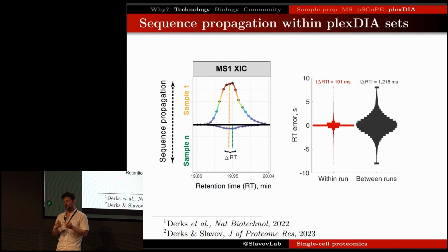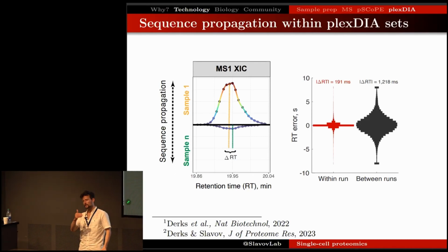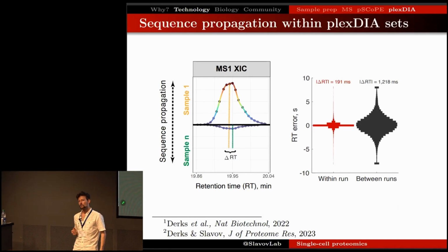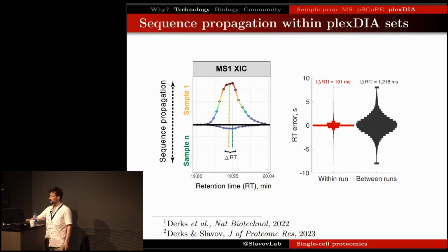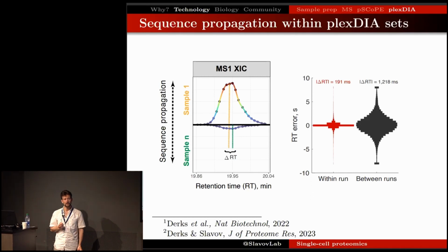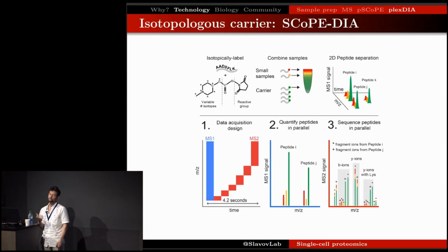And essentially, the higher precision, the higher accuracy is present both at the precursor level and the fragments. And at each of those levels, it gives us more statistical power to robustly identify signal. And as Jürgen already explained this morning, how those features are being incorporated in MaxDIA, which is wonderful to see, and how this can be extended to isotopologous carriers.